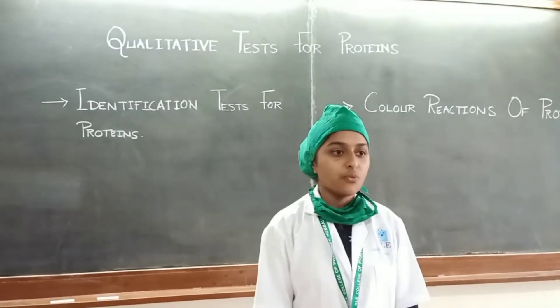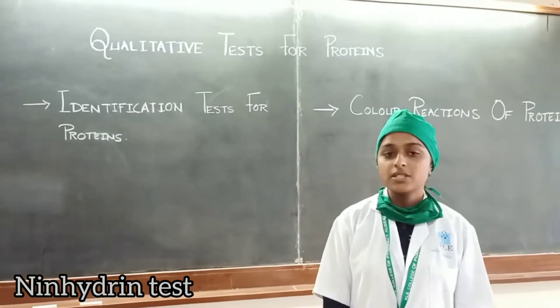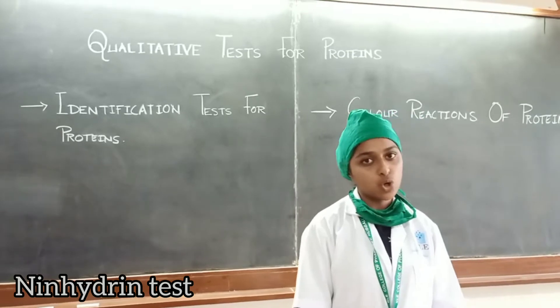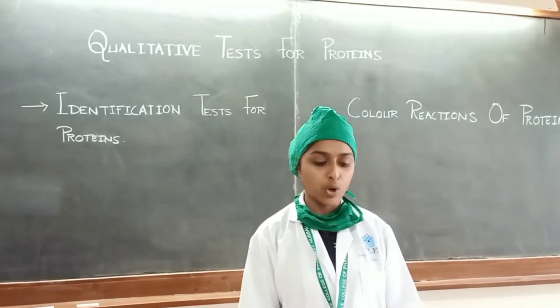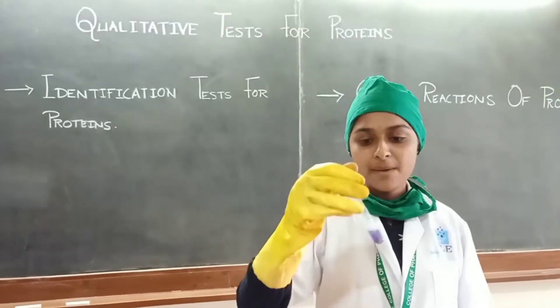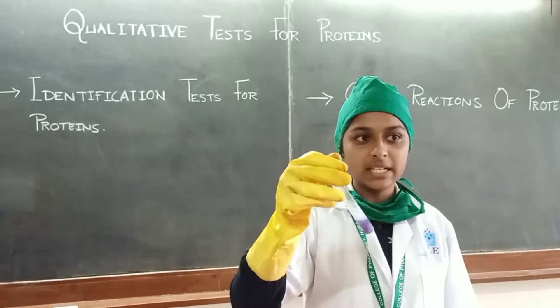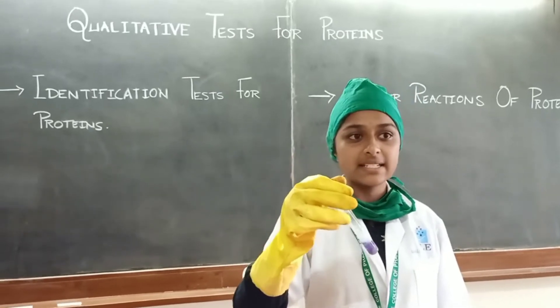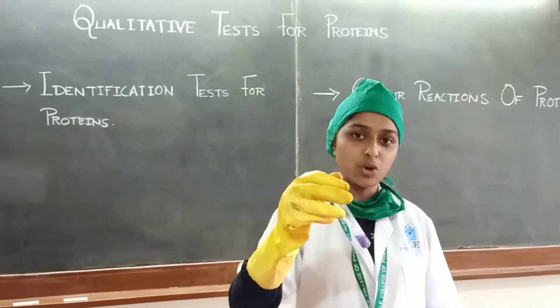Ninhydrin test: 1 ml of sample solution plus 2 drops of ninhydrin reagent, heated. By observing it, appearance of a purple color indicates the presence of amino acids and proteins.